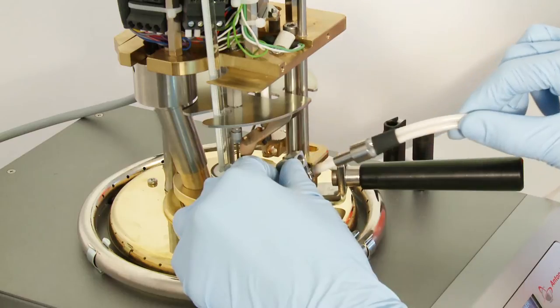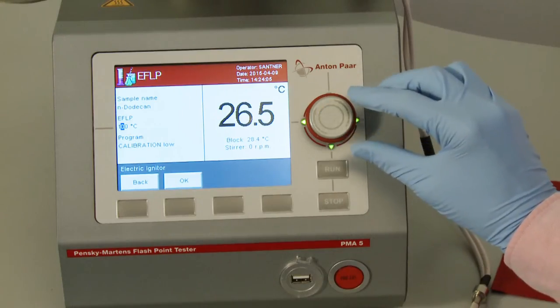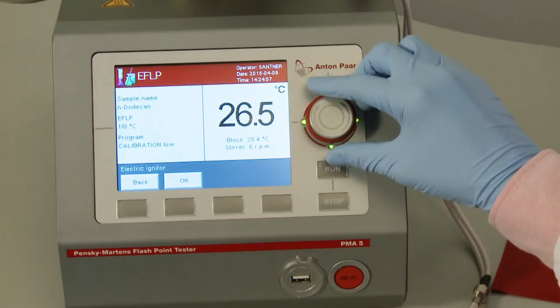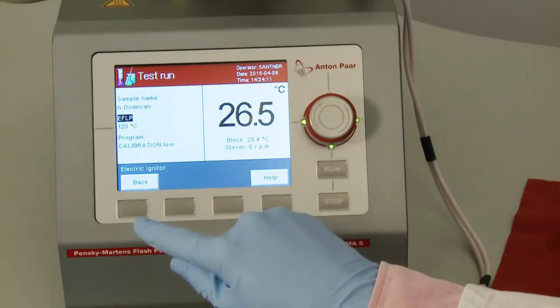Disassemble the igniter. Enter an expected flashpoint of 120 degrees Celsius in the test run menu of PMA5. Now you are ready to start the test.